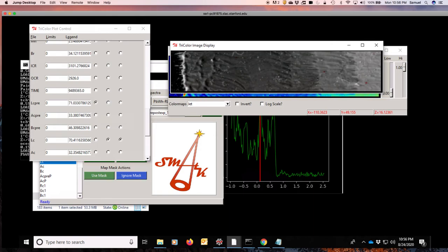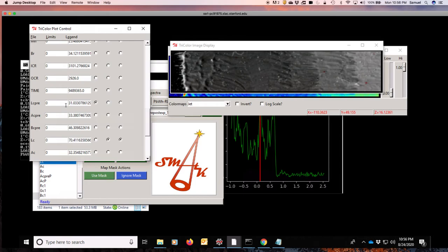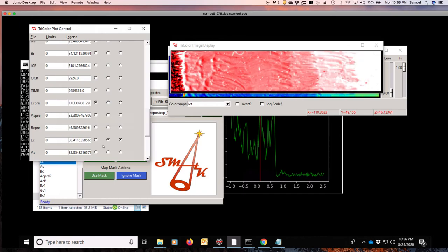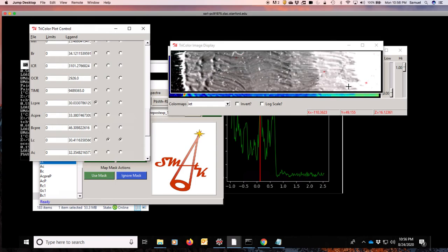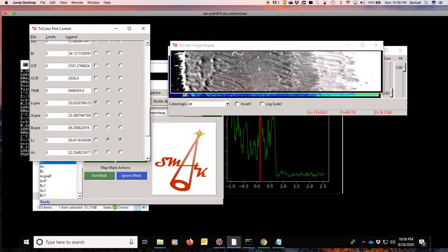Instead, we see these locations of more intense red. This is showing that the luminosity in the pre is stronger than the luminosity in the post. And this suggests that there's been darkening due to the x-ray exposure of taking several XANES points at each of these positions here. So we can actually use our UV-visible spectrometer information as a way to characterize if there's been any damage or scarring on the sample. And we can even characterize what exactly is happening in a hyperspectral color way.